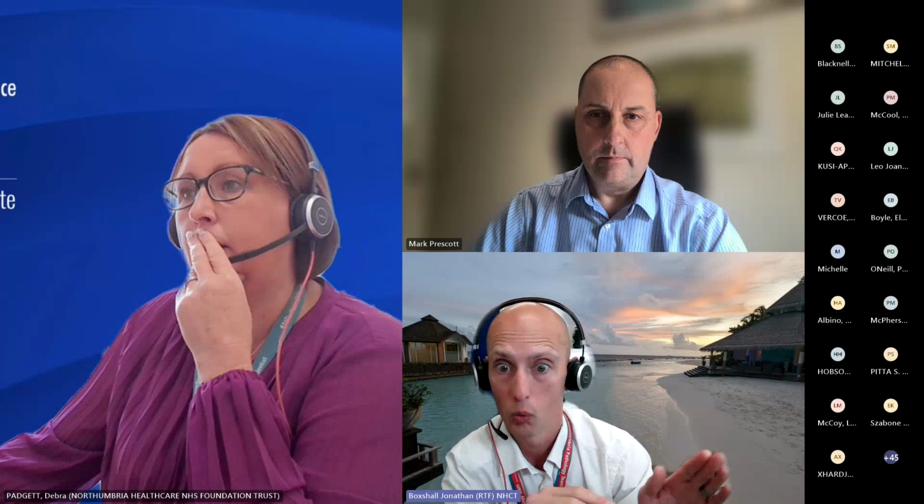So we're not going into the minutiae of the actual system and saying you can do a very specific function, but you can do booking in of patients' requests, etc., and you understand authorization or work lists or whatever sort of quite generic areas. Because if we had gone down the fundamentals of knowing exactly how to do this thing, and then it changes and changes, I think you'd be stuck in a perpetual loop of constantly having to re-competency assess.